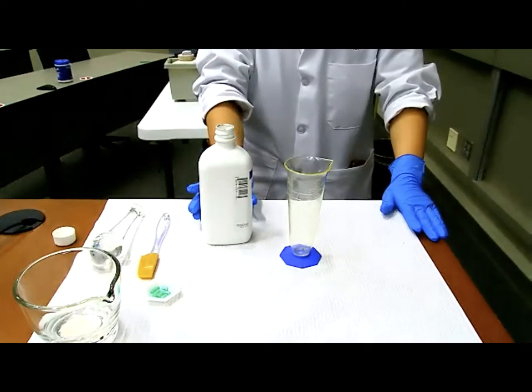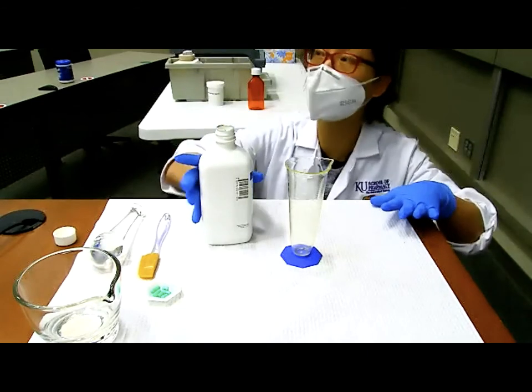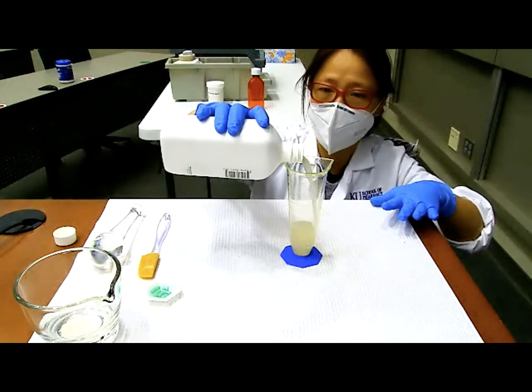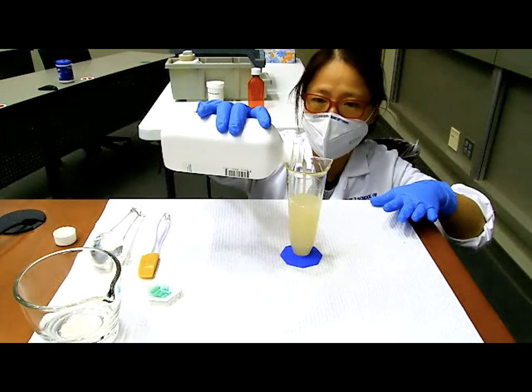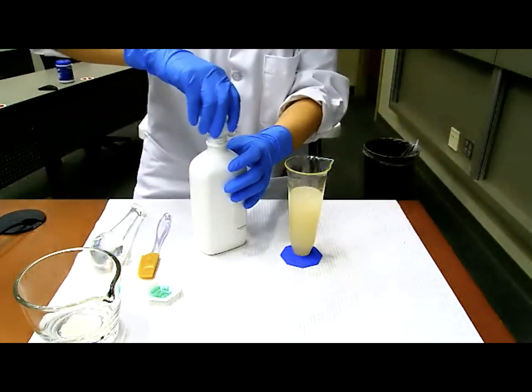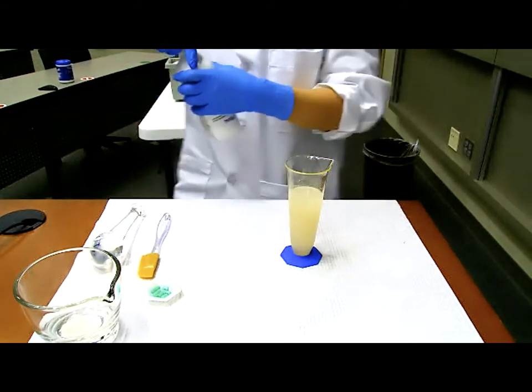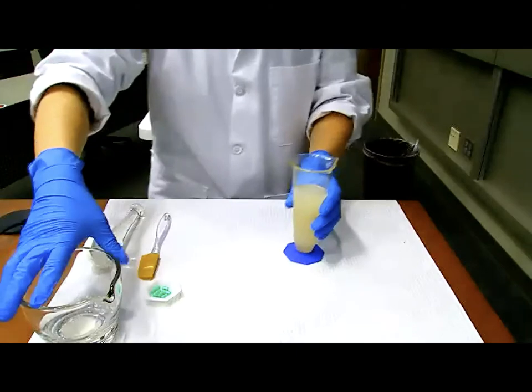And pay attention to me. How do I bend my body? I am going to kneel down and transfer 100 ml into the conical. The reason I am bending down is because I want my eyesight to match the surface of the liquid I'm putting in there. I don't want to have too much. If I measure it this way, my volume is not accurate enough. So you should do the same thing in the lab. Now we are ready.